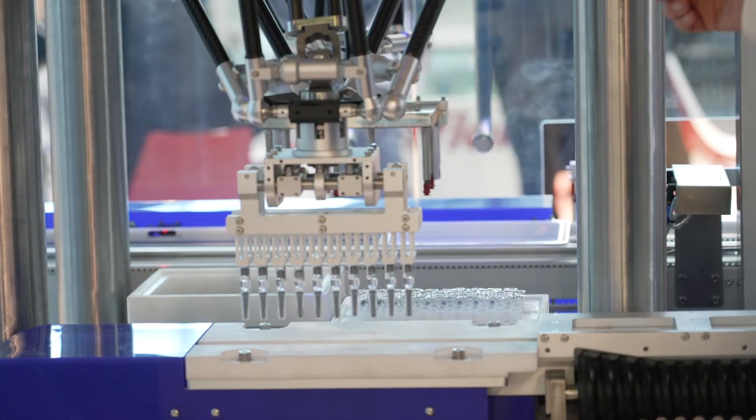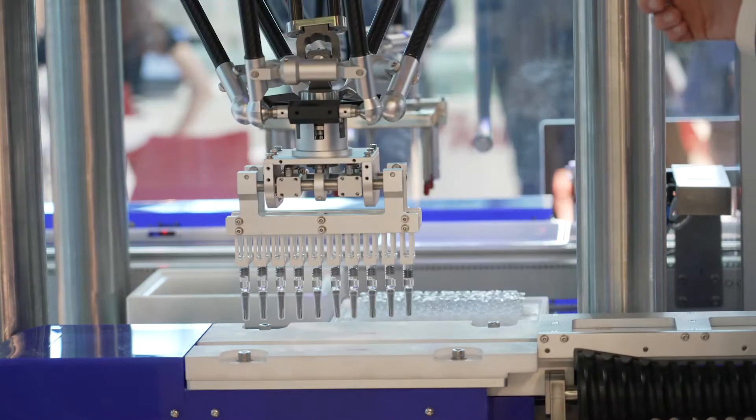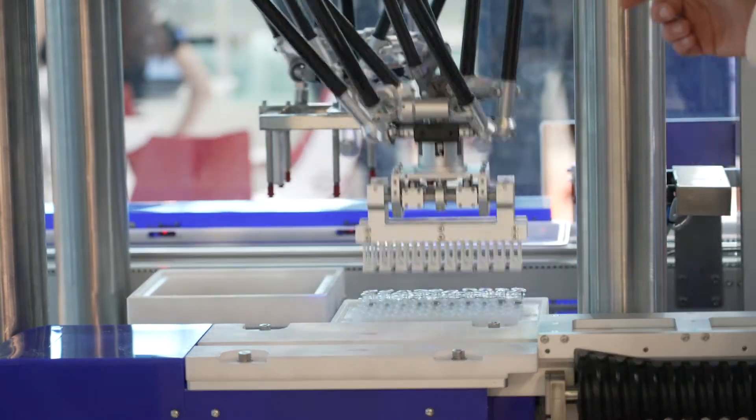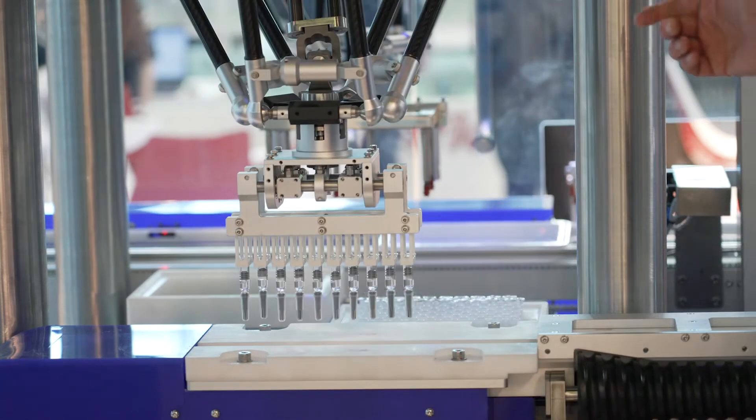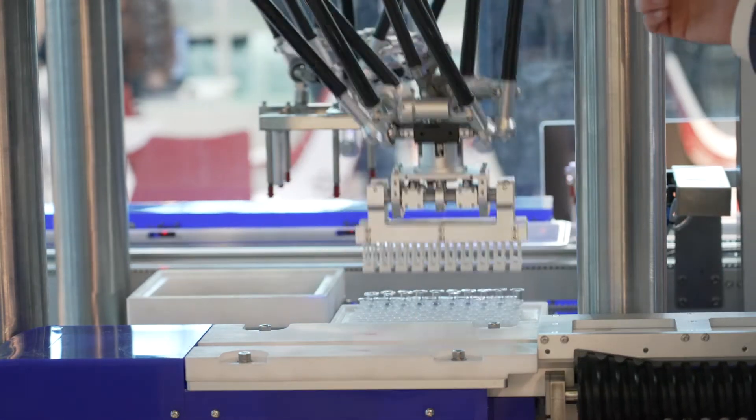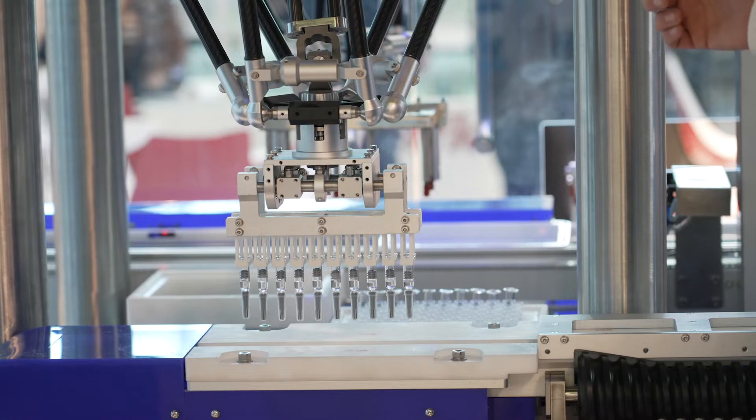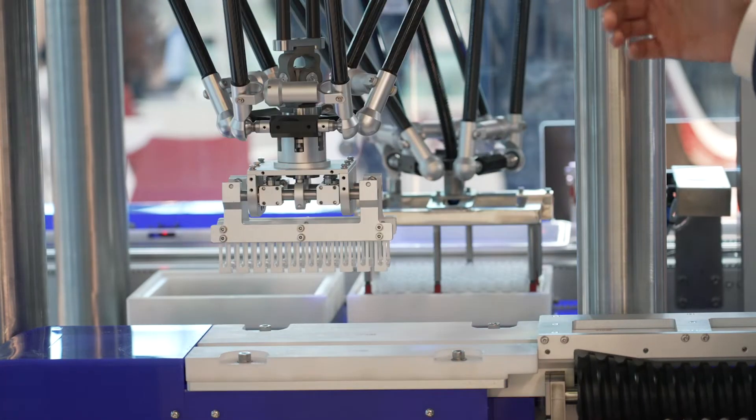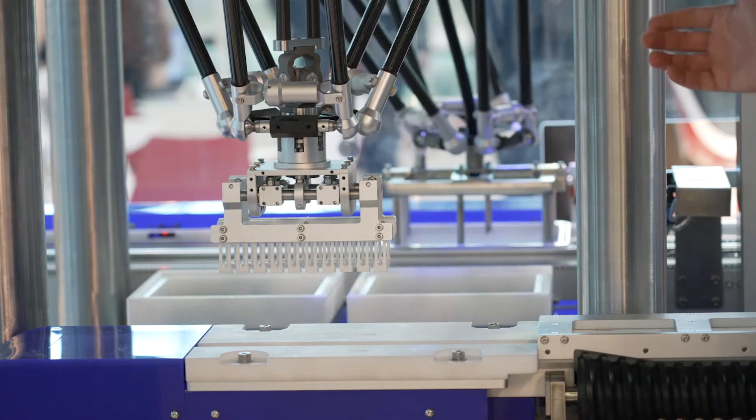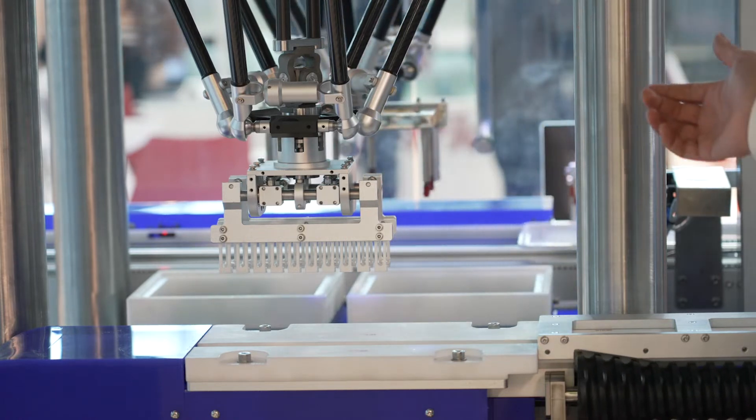We are using two robots to provide a very gentle and smooth movement as well as a high production speed. You can see the products are not shaken to avoid air bubble generation nor damaged in any way. This is very important to combine high production rate with good inspection quality.